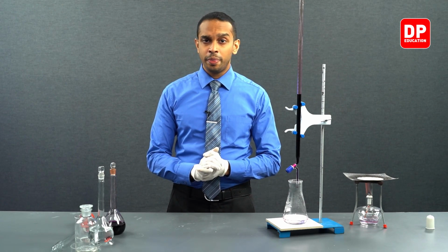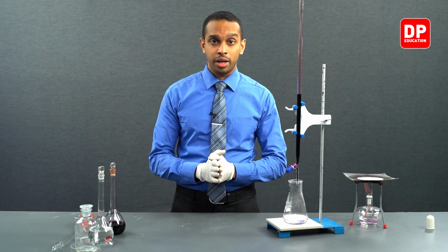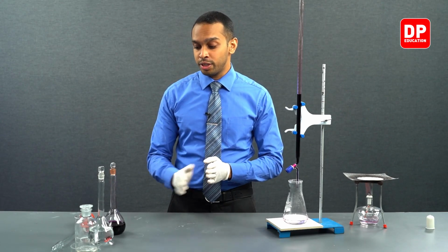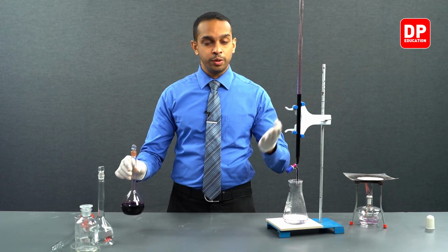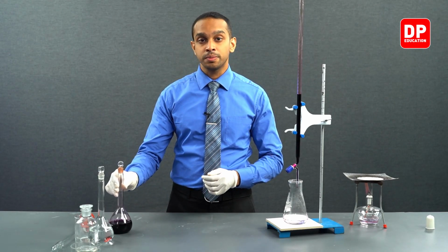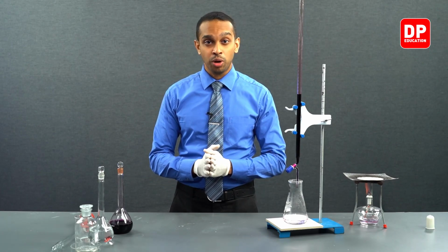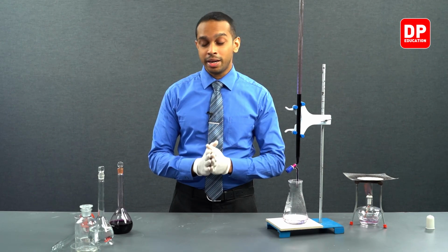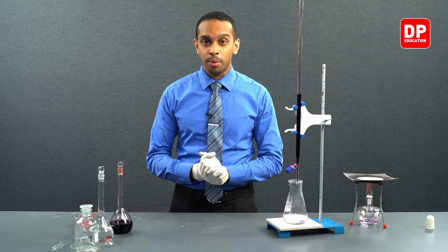So with this information now, we can go on ahead and calculate the concentration of this potassium permanganate solution that we have used to carry out this titration. So let's move on to our next session, where we will be discussing how to carry out that calculation as well as some important details about this practical.